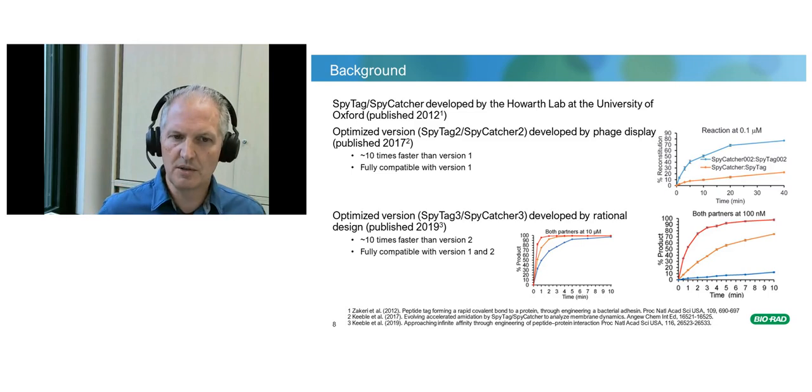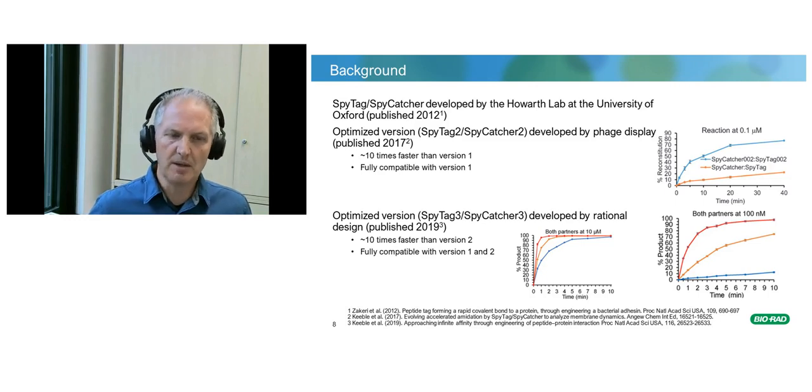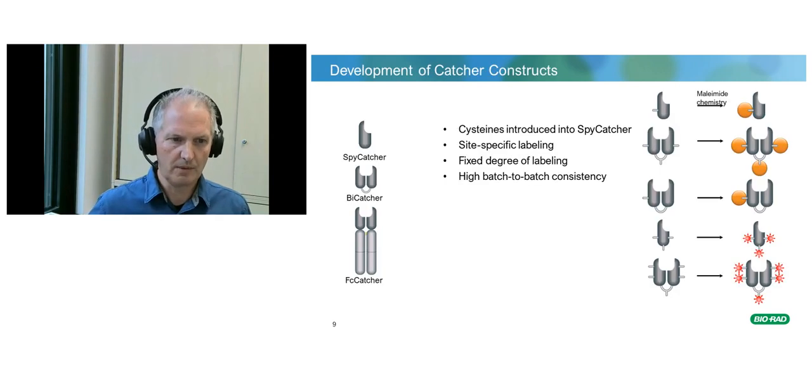In this presentation, you will see data generated with SpyTag 2 and a mixture, sometimes SpyCatcher 2, sometimes it's SpyCatcher 3. But basically, the version 2 works quite well in our hands, so there's no immediate need to switch to version 3.